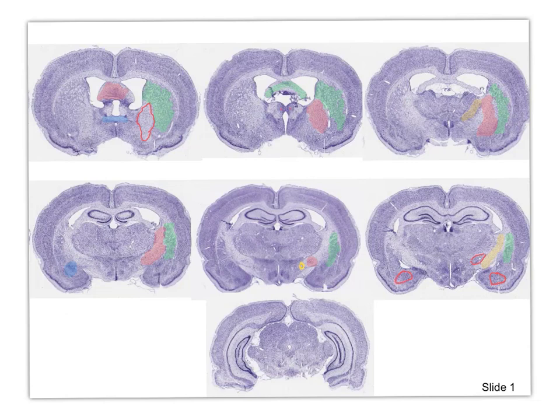Okay, and then finally, going more posterior, just to show you more parts of the basal ganglia, to orient you. This is the superior colliculus up here, periaqueductal gray. Here's the cerebral aqueduct right there. And we have, nicely enough, a medial geniculate nucleus. And here is a substantia nigra. We'll do that in green. Substantia nigra. This is the cerebral peduncle. Right there. So that's pretty much the entire basal ganglia.